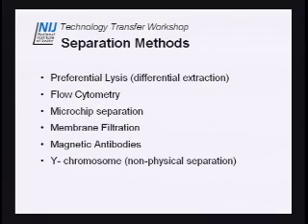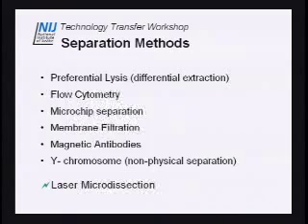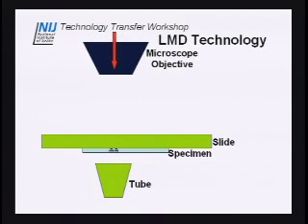There's also Y chromosome testing. Even though it's not really a physical separation method, it is obviously used in DNA mixtures and is extremely useful, although it doesn't provide the statistical power that the CODIS 13 loci can provide when you have a mixture. So we propose, of course, that we use laser microdissection to separate your sperm cells from your epithelial cells. Here's a real simple diagram. Actually, I'll write on here.